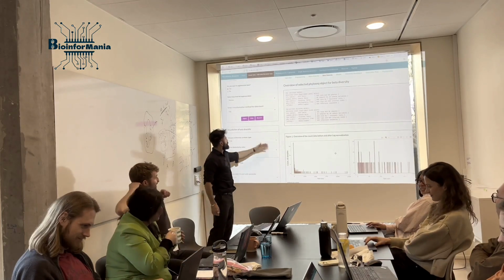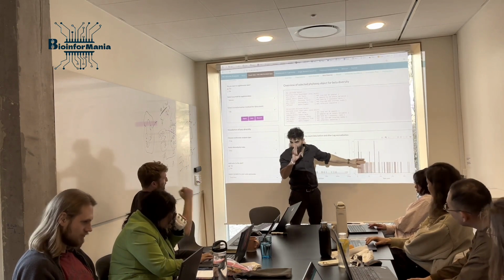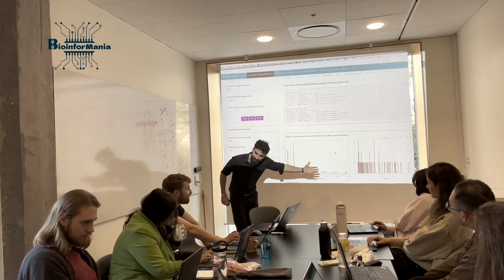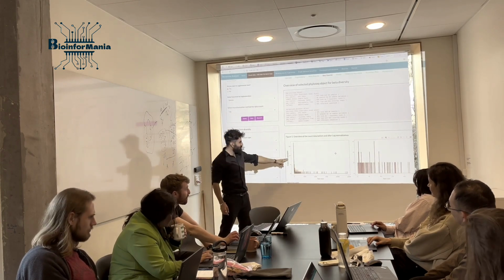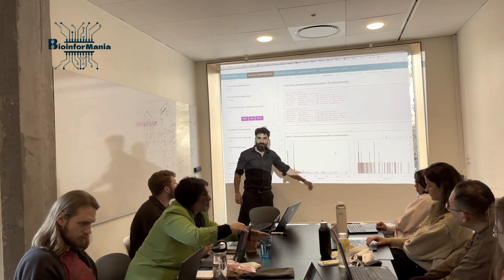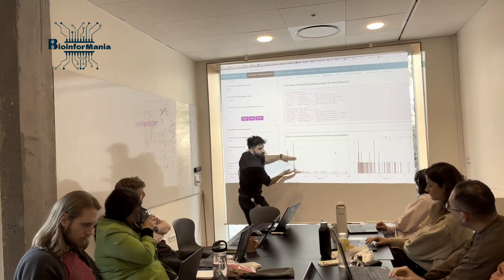This is beautiful. This is so powerful. You see, this is what I mean. Uniform distribution. But don't tell anyone that you heard it from me. It is good to have this uniform distribution of data from this side till that. So it brings up the ones that are less expressed and brings down the ones that are highly expressed.